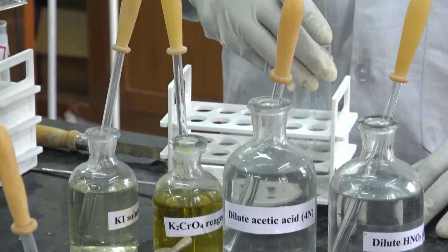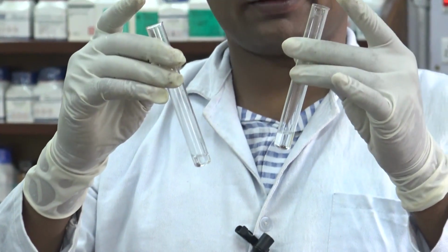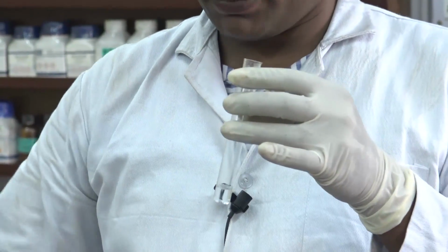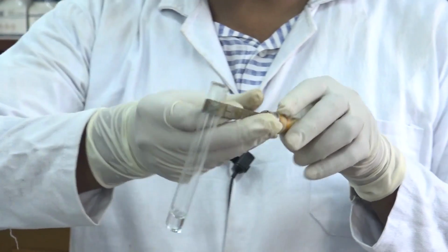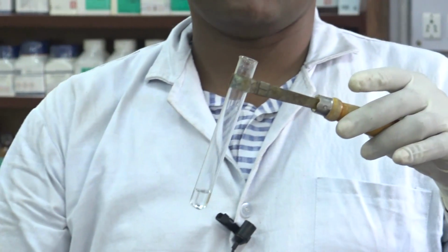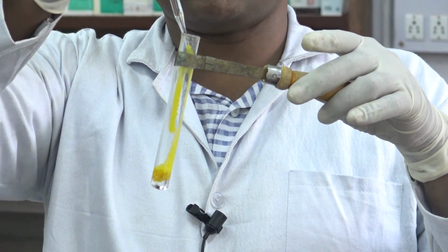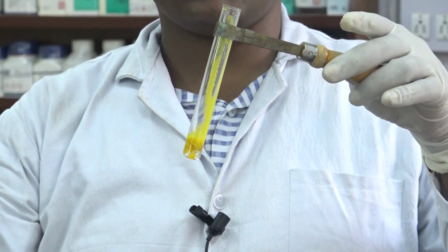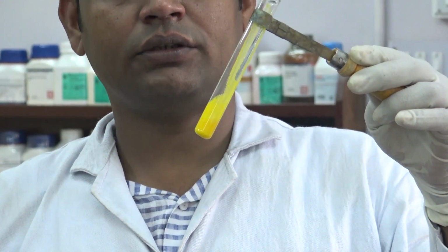We have prepared the sample solution and taken it in two parts. For the first part, we take it in a test tube and add a few drops of potassium iodide into it. Here you can see that a yellow precipitate appears.